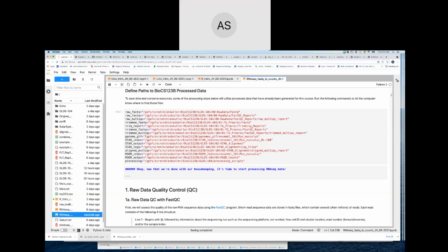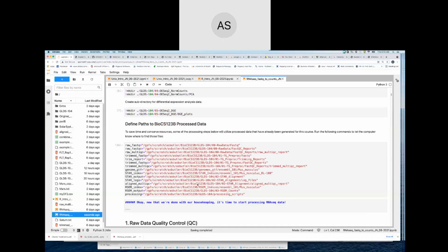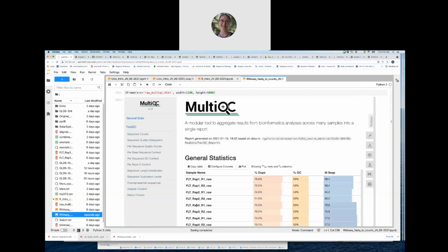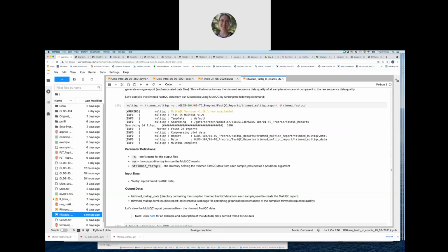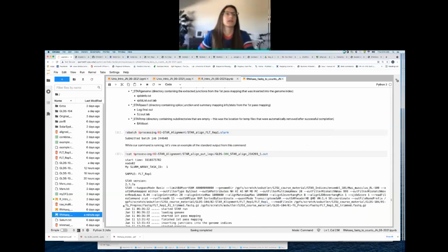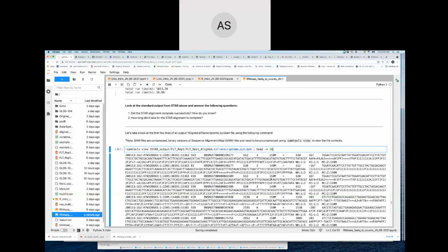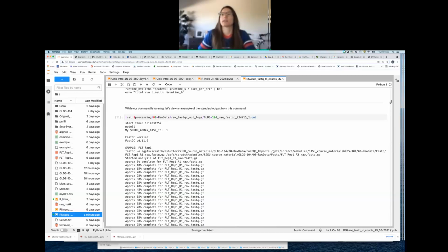You could first see if samtools alone is working. And then if that gives you any output at all, see if maybe it's the grep that's taking too long. Yeah. Well, we know that samtools is working because we just ran those commands above it, right? Yeah, it could just be that the grep has to search through such a huge file. We just reran this. So I guess let's try looking at that transcript.